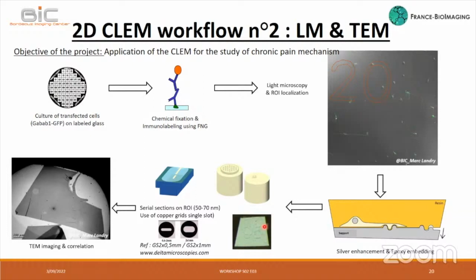It's not the same number, but I don't have the right picture, so sorry for that. But you understand the principle. We do sectioning only in the right region of interest. We deposit on a slot grid, and we observe in TEM.